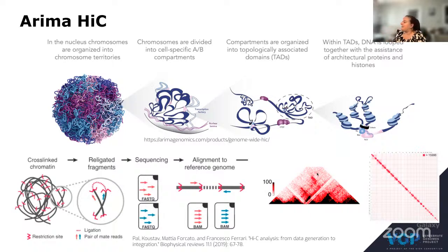So what you get is this heat map data, where you can see that across one strand of DNA, you have very strong contact between Hi-C reads when you are close, and then it gets lighter and lighter the further across the sequence you get. And this gives us information about the large-scale organization of the sequence. We're using this data at several steps of the assembly, and I'm going to talk about it in more detail later.